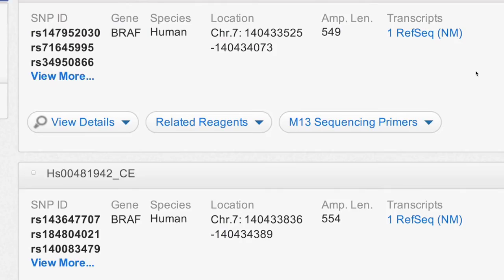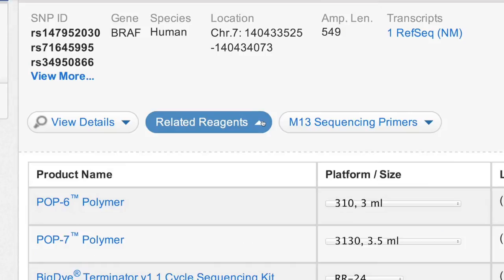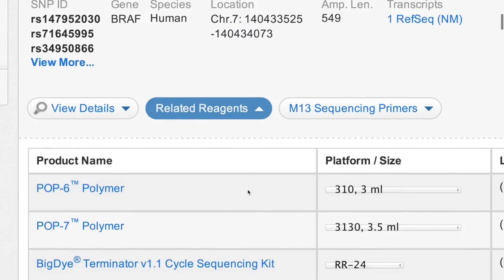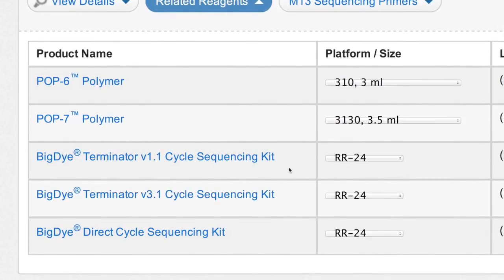If you select a primer pair with an M13 tail, you will need the M13 sequencing primers here for your sequencing reactions. The Primer Designer tool also suggests other consumables, like polymer or Big Dye Terminator kits. Simply select the reagents appropriate to your instrument.